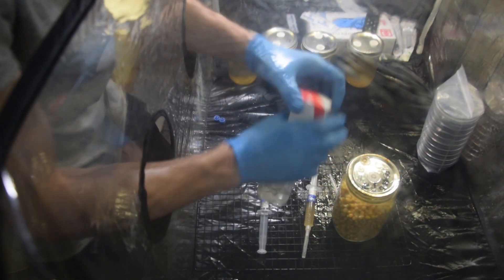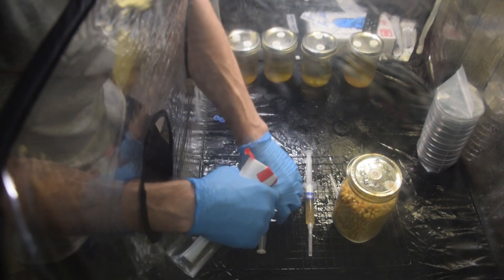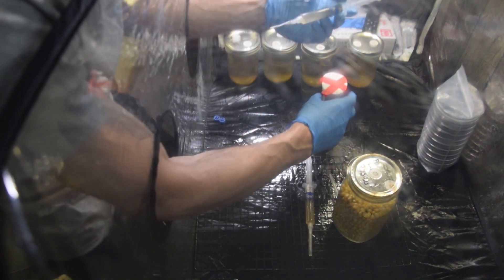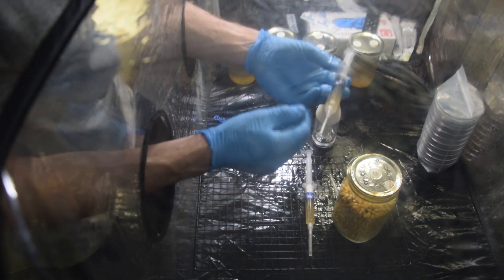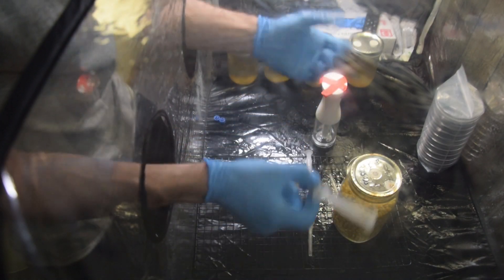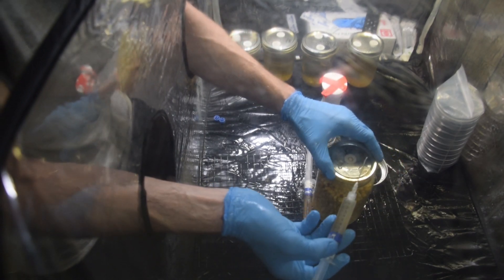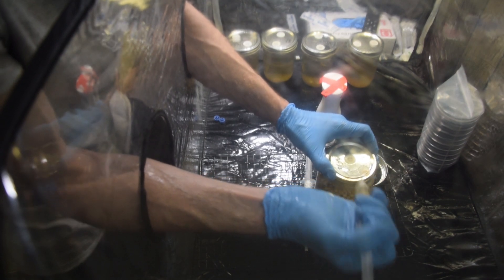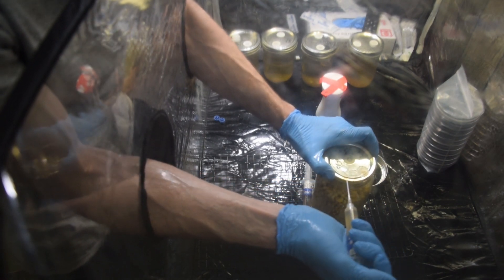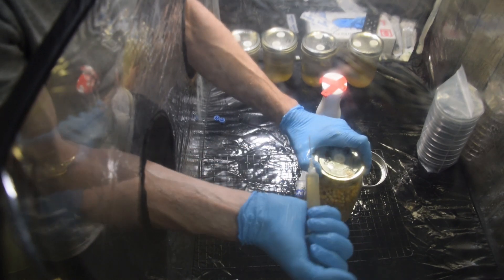Typically what I'll do is spray around the jar like I did, and spray the syringe a little bit if I need to. This is a sterile needle that came with the syringe, so I'm not going to flame sterilize it. For this, it's a clean syringe so I don't need to flame sterilize it anyway. You'll see here what I'm going to do — I'm just going to slowly crack the lid, and I'm going to use one to two cc's of liquid culture.